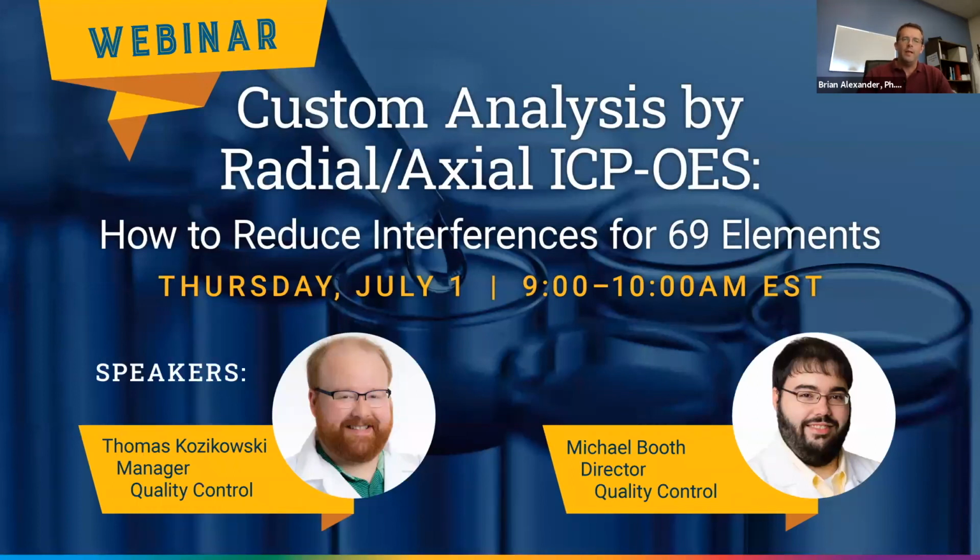Have you with us today for the presentation on custom analyses by ICP-OES, with a focus on how to reduce interferences for 69 different elements.